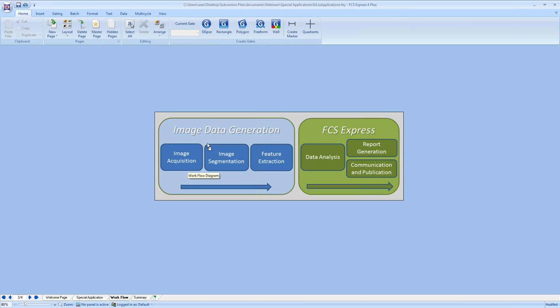The next step is going to be an image segmentation. And image segmentation software packages such as CellProfiler or ImageJ, even packages from Molecular Devices from their Velos instrument, Chemometec, NexCelom, these are a few packages that we are currently compatible with. And the image segmentation is going to allow you to define cell boundaries, define where an object is, define where something is in the picture.